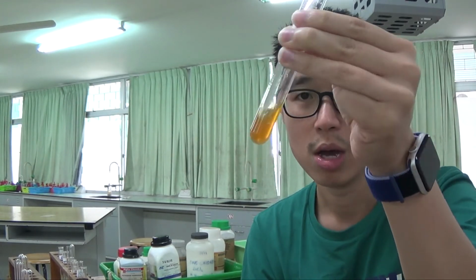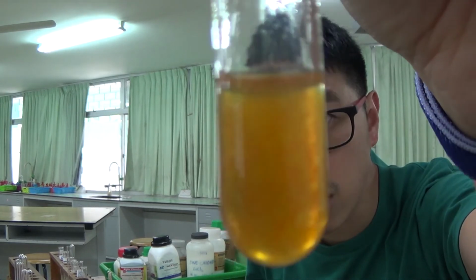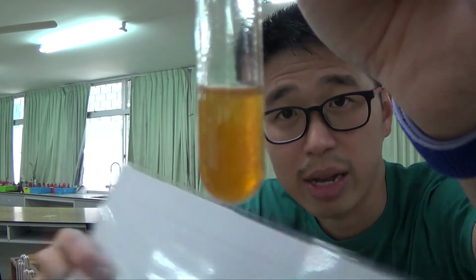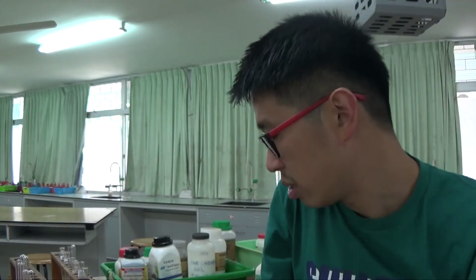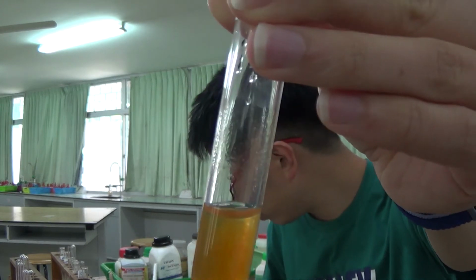So a double salt is a mixture, whereas if you use a pure iron 3 salt like iron 3 chloride or iron 3 sulfate, which is in stock, but I don't want to go back to the store and get it. But if you look closely, I don't know if you can see it, there are some precipitates suspended inside the solution. So this is an orange, reddish brown actually, they call it reddish brown.